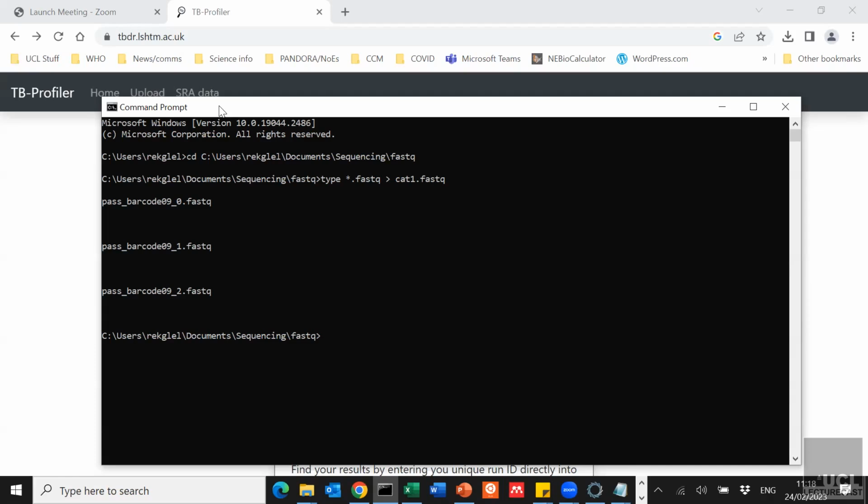You can go to report that. Yeah, I use it. Yeah, it's really nice.